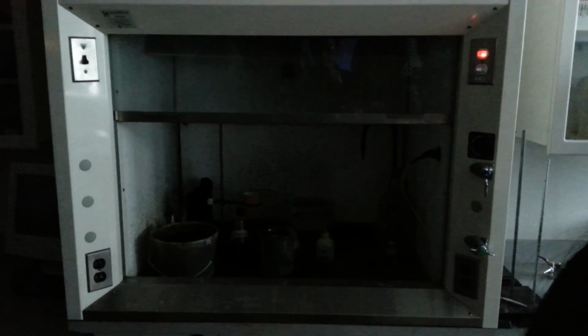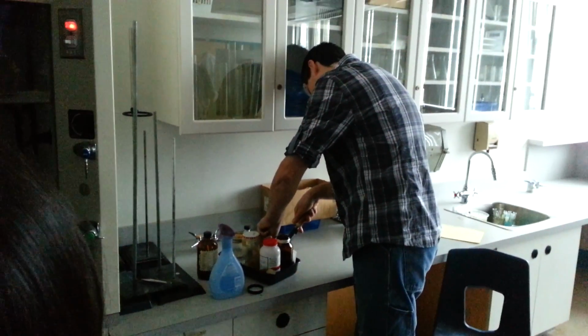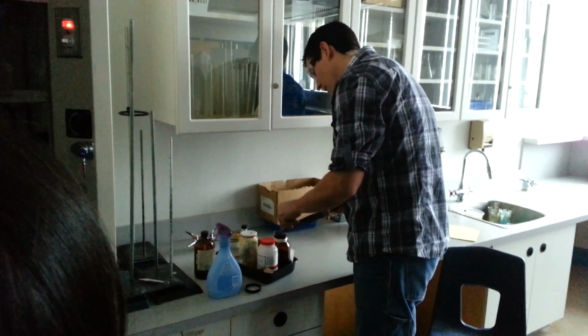It's gonna smell fantastic. It's not Febreze. Do you want me to do that one again? Yes, please. I have a feeling if you peer pressure him enough, he'll put the entire class in danger.